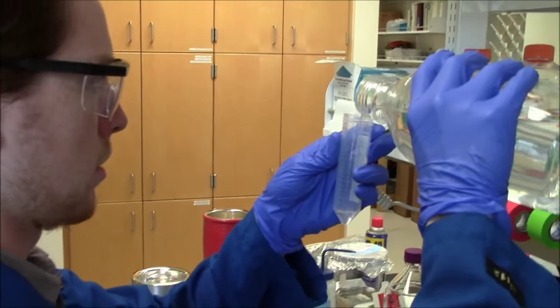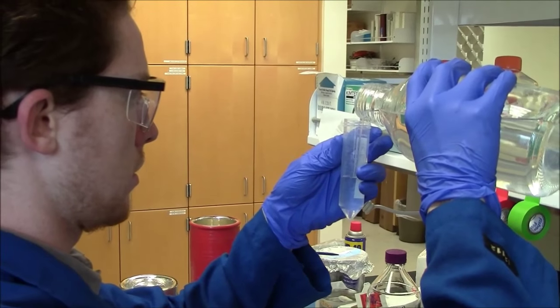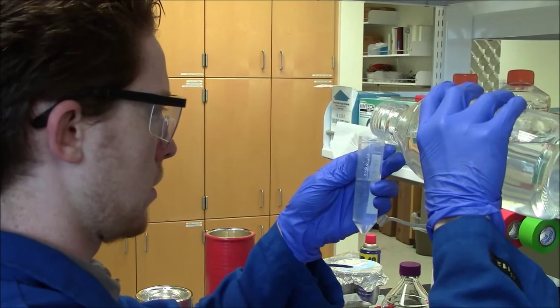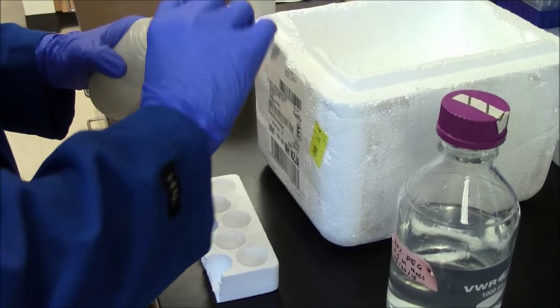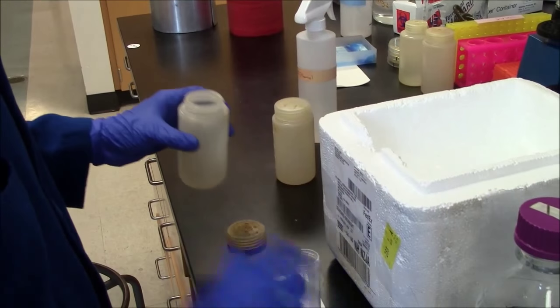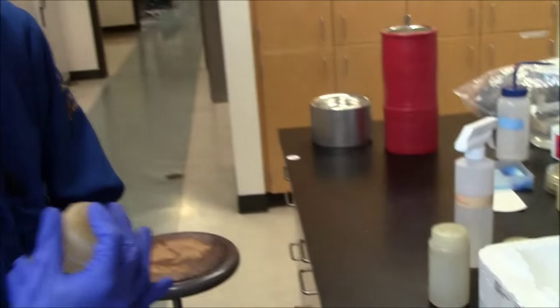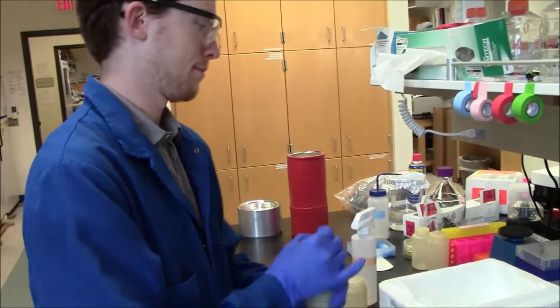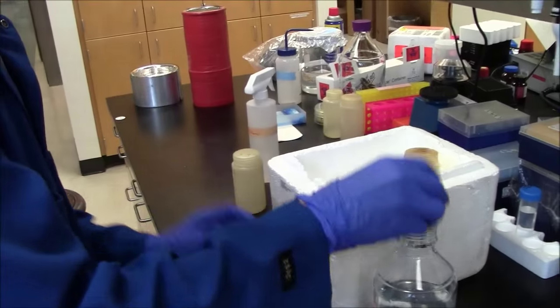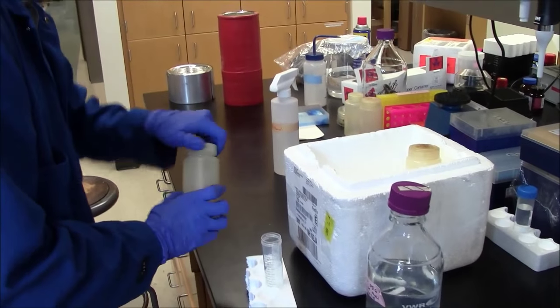The recommended volume is 1/5 of the volume of your cell culture. So here we're using 30 milliliters of the PEG solution for 150 milliliters of the cell culture. And you can see this is going into centrifuge bottles, which are then going into the ice. The colder, the better.